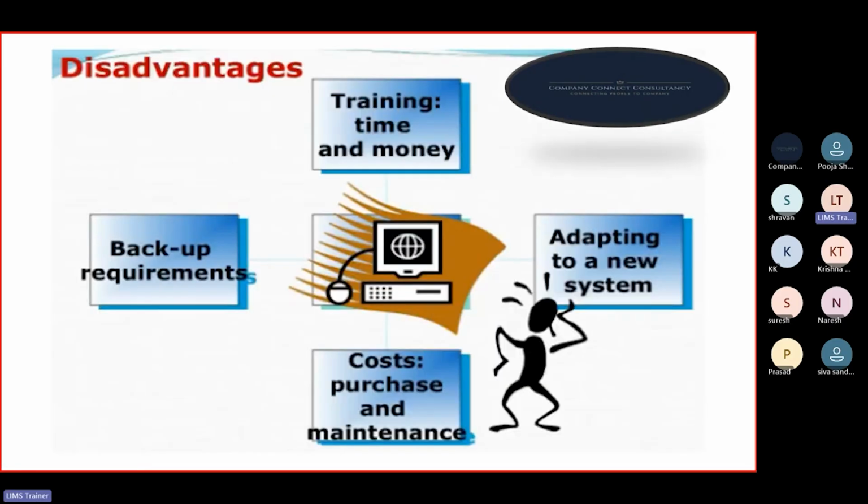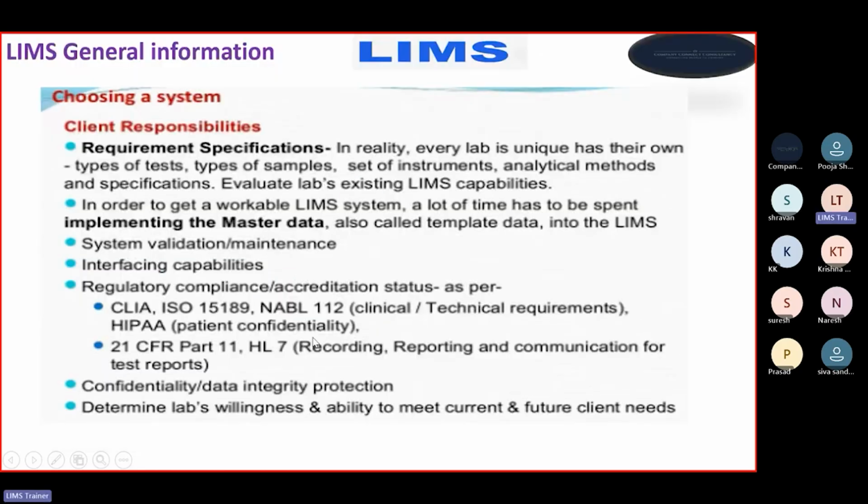Then let's see some disadvantages as well. Each coin has two sides, right? So if there are some advantages, there will be disadvantages as well. It will require time and money for training purposes, adapting to a new system, cost of purchase and maintenance, and backup requirements, right?